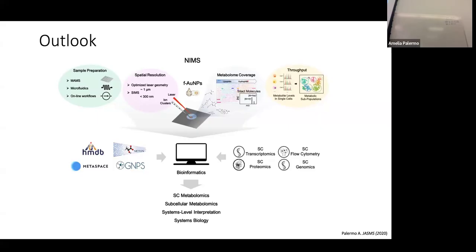And I would say the literature here has a bit of a consensus that, because it's the frontier and the limitations on obtaining those MS2 from this type of measurement are known, the expectations for reaching the fourth level of identification are usually lower, as long as it's clearly disclosed that it's an annotation, not a full identification. And the throughput.